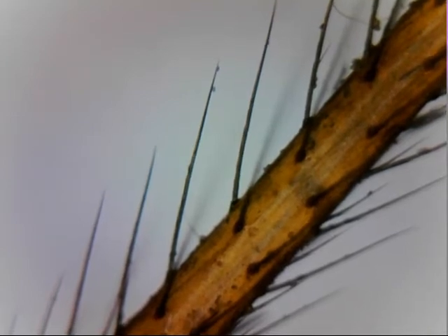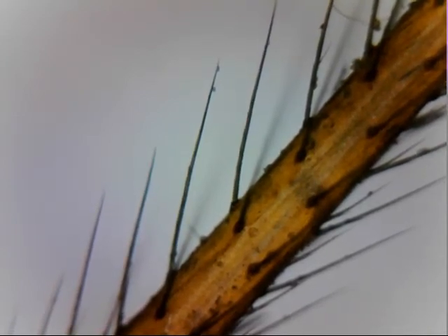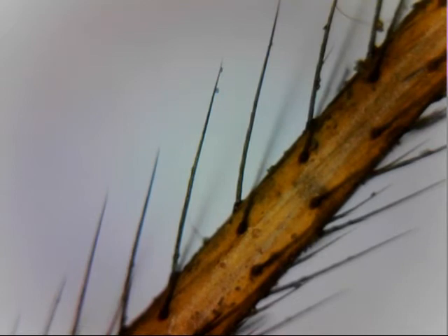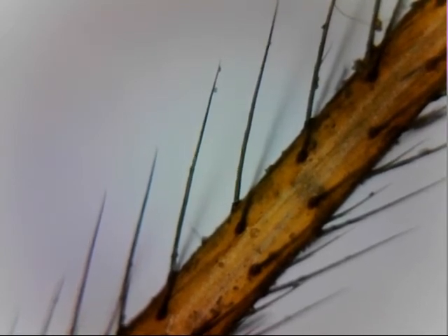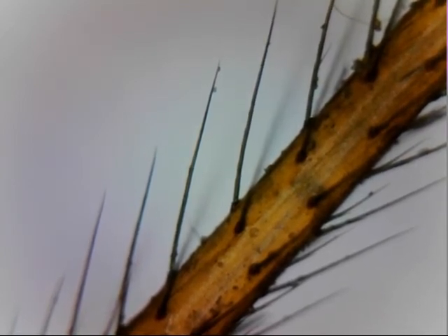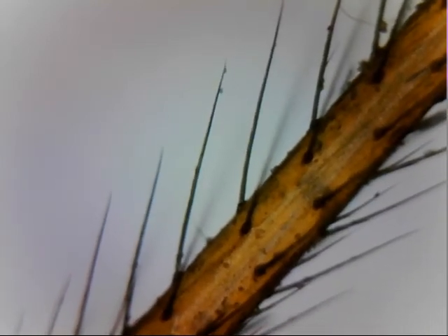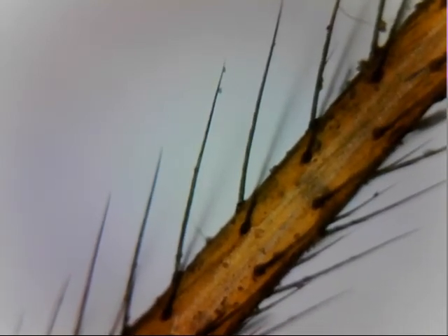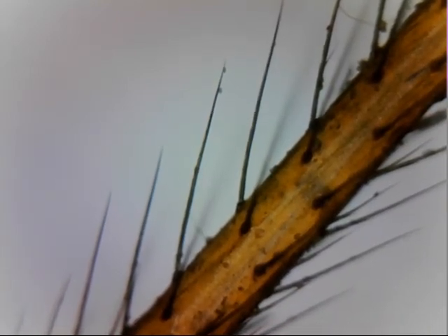You can't see though. I mean, you can if you look real close, but it looks more like a texture. You don't see any. You cannot see one individual spike. So, sorry. This has been Danny Longlegs Spider.